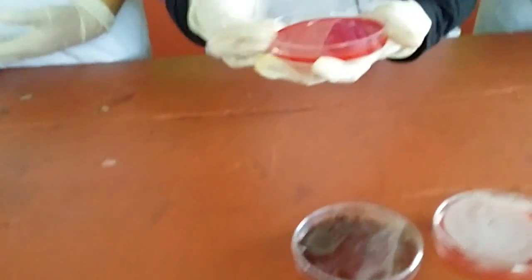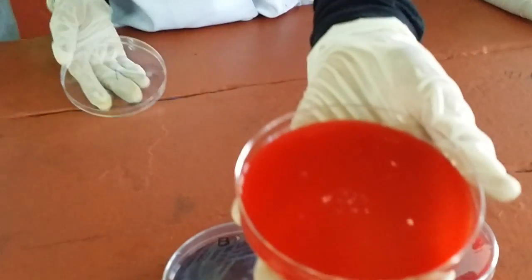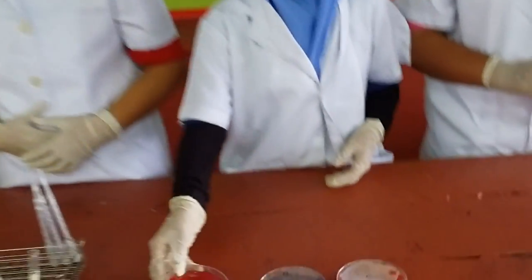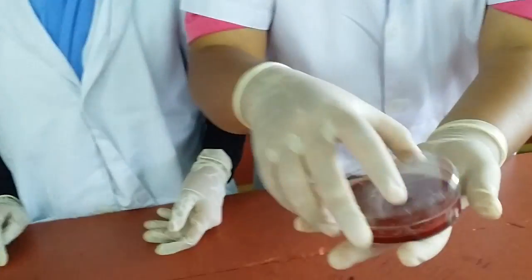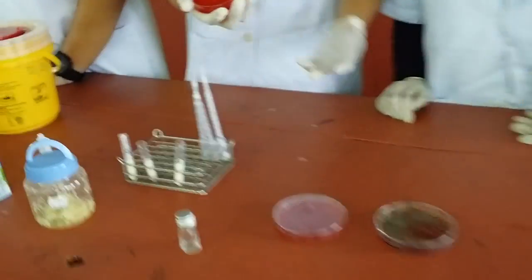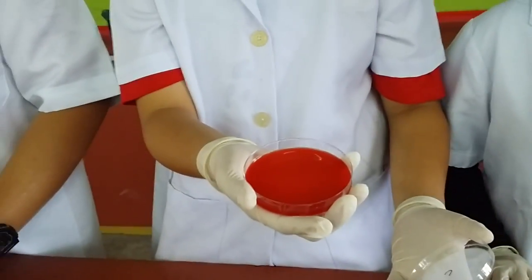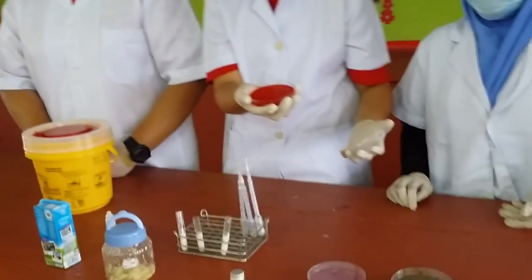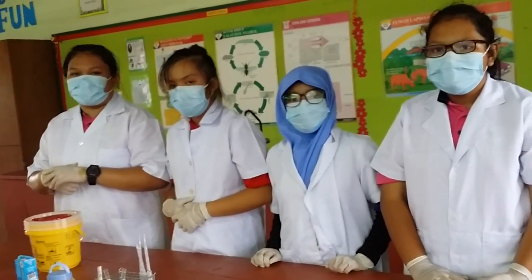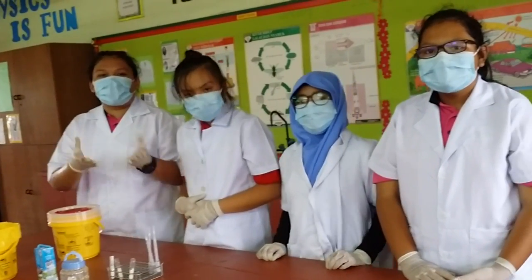In petri dish A, you can see a little bit of bacteria growing in it. This may be due to contamination. The biggest colony of E. coli bacteria is found growing in petri dish B. In petri dish C, there is no growth of bacteria because the garlic contains mainly the molecule allicin. Allicin can prevent the growth of bacteria. This experiment shows that garlic can be used to kill the E. coli bacteria.